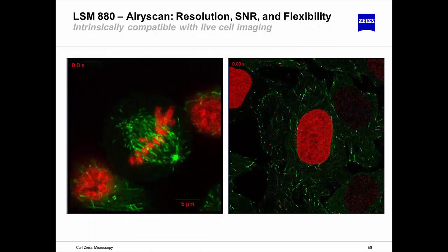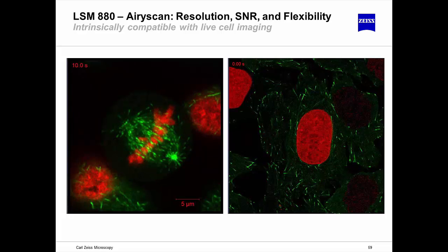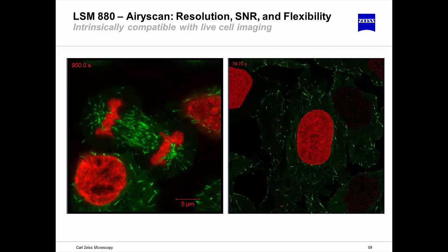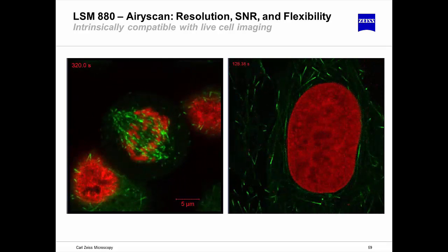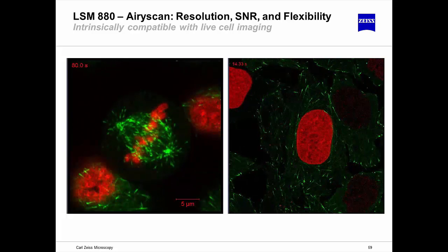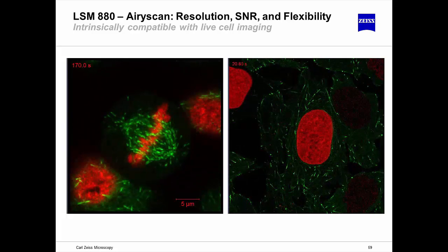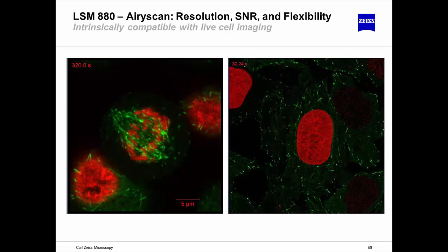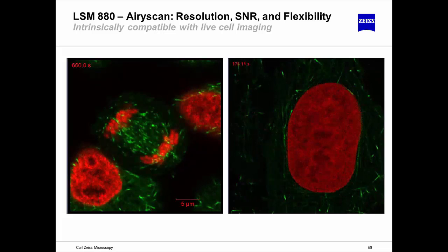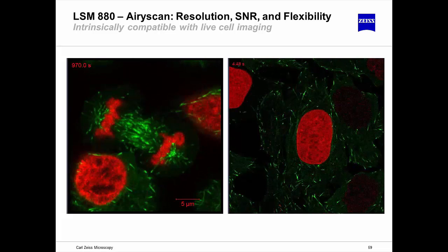Really, with the Airyscan technology, what we've done is find a way to overcome one of the bottlenecks in the confocal, which is really the pinhole, by squeezing more information both from within the Airy disk, but also from acquiring from a slightly wider area. And it's really going to let us do things over the next few years that we simply didn't dream we could before.